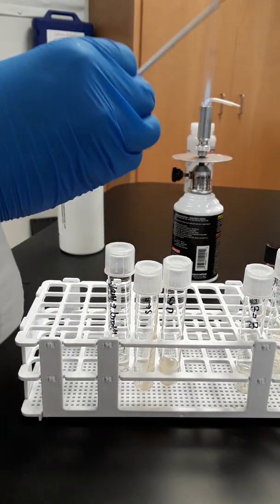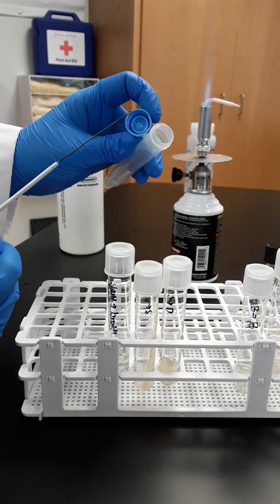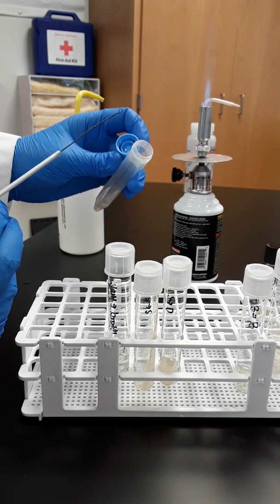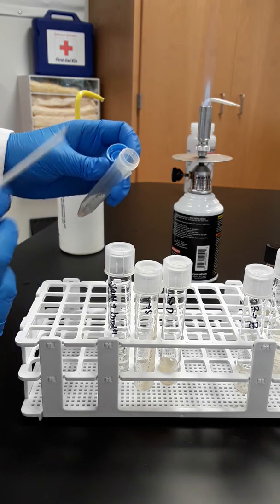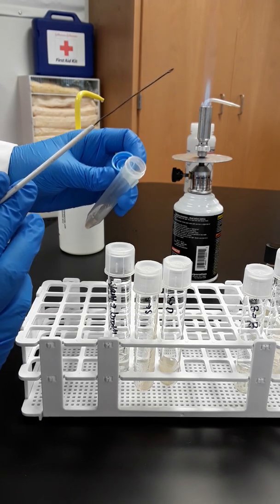So we have our sterile loop. We're holding this with the cap, nothing touching the inside of the cap, because if you touch the inside of the cap, you contaminate it. So none of your fingers touching it, nothing. The only things that can touch it are things that are sterile. This loop is sterile because we sterilized it in the flame. Our fingers are not sterile. There is no way that any part of our body or our gloves will be sterile.